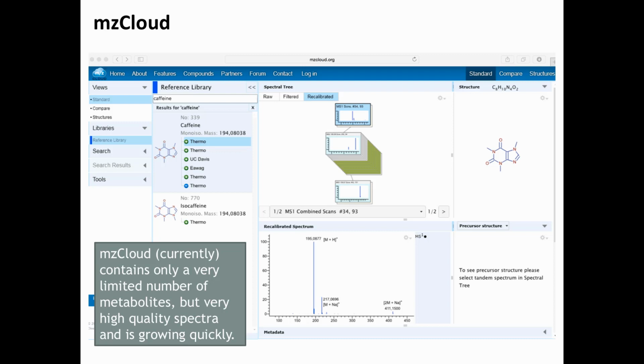And they recorded it very diligently on, surprise, surprise, their own instruments. So they did that in a very consistent fashion, very high quality spectra, high resolution spectra. But again, you can't download it. You have to go through their interface, have to go through their software if you want to access it from the instrument itself. But otherwise, neatly done.